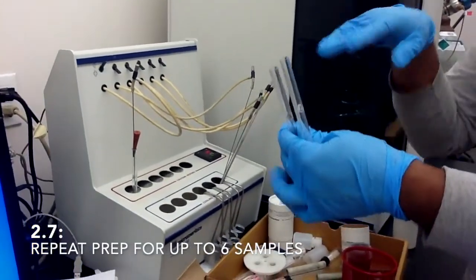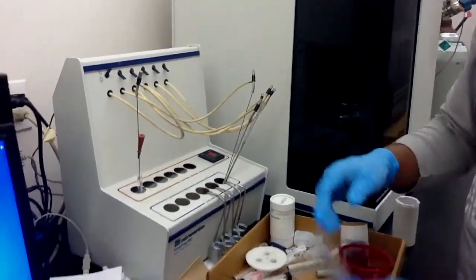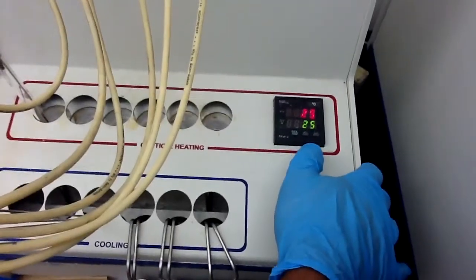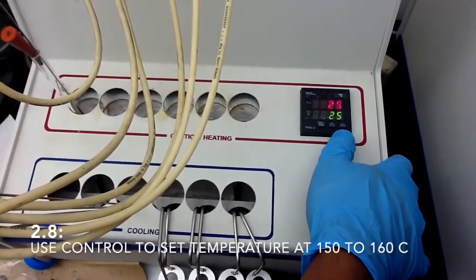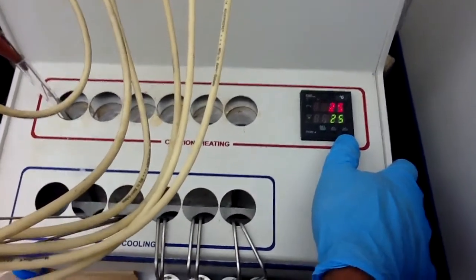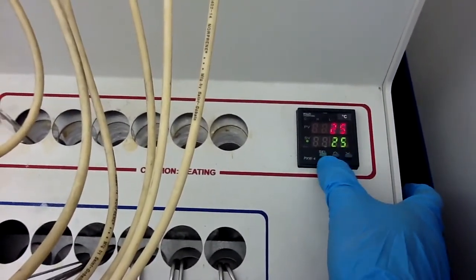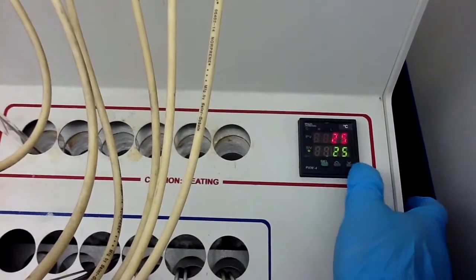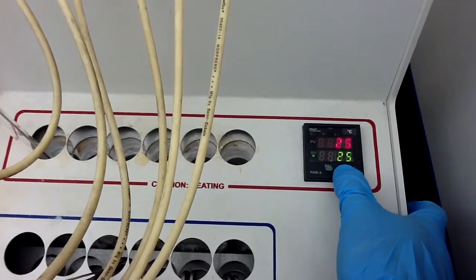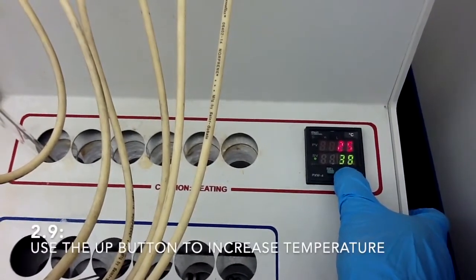At first weigh your tube, then put your sample, then measure the weight of the whole tube. After this, you can just put your tube here. Now you have to set the temperature. Usually I recommend 150 to 160. That temperature is enough to remove any moisture or any other impurities. There are 2 buttons here, this is up, this is down. If you want to increase the temperature, this is the up button. Suppose I want 150 degrees Celsius. So all I have to do is just hold it here.